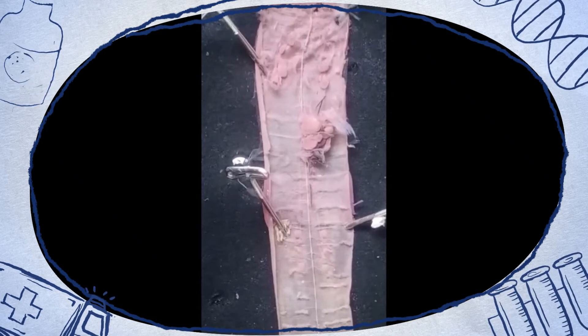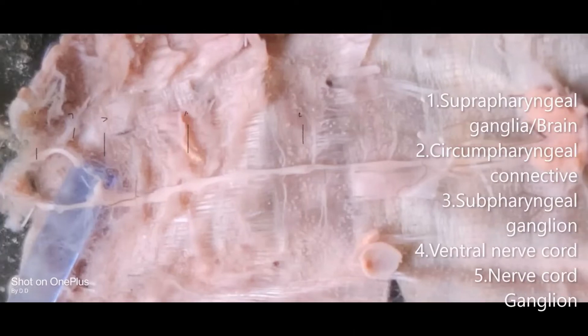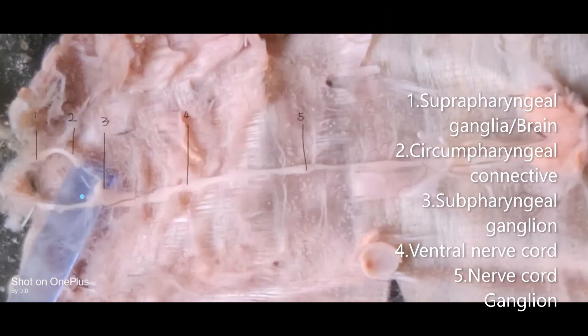Now slowly start removing the remaining parts of the digestive tract to expose the nervous system and free the nerve ring. The digestive system passes through the nerve ring.